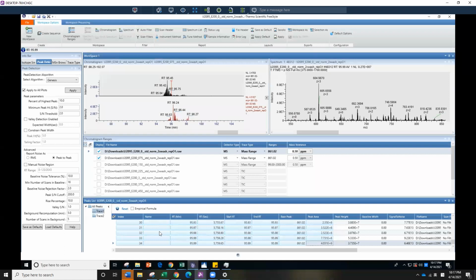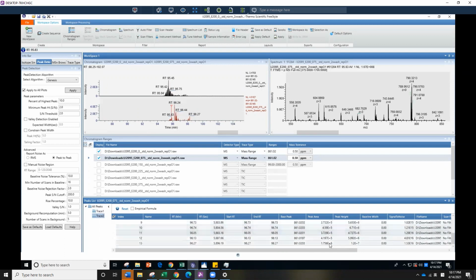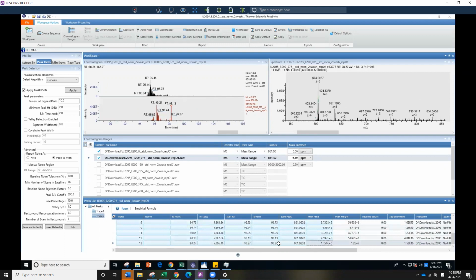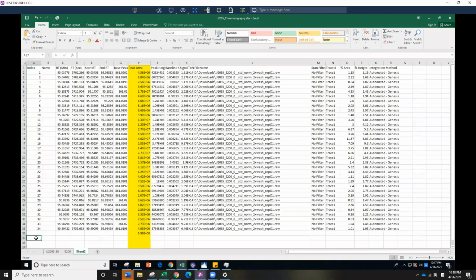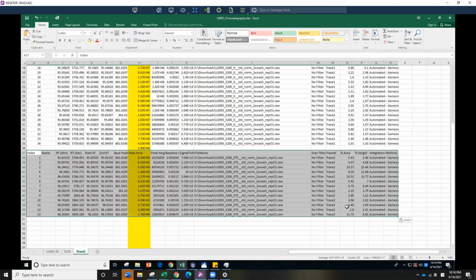Okay, and then you go to your trace 2, that is your second file, and it starts from 96. Okay, so it doesn't have a lot. Oh, it starts from 95 to 96. So do the same things, and then just copy them. Actually, we'll copy the entire table whether you like it or not. Then come here, copy, and paste that. And that is for your trace 2.